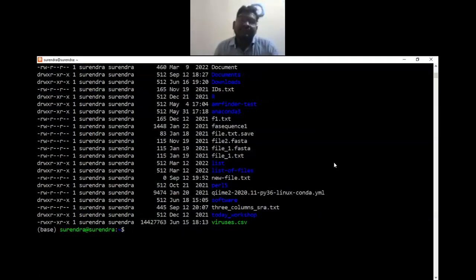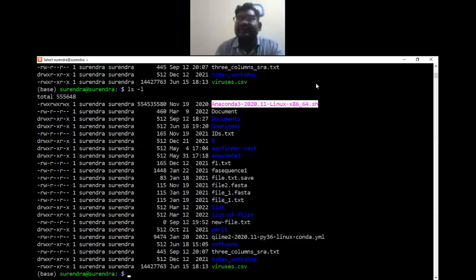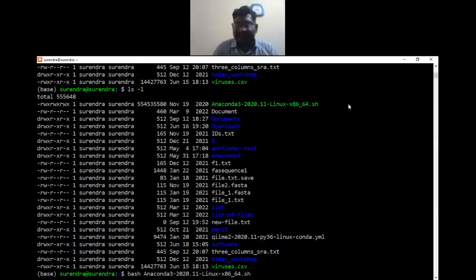Anyway, if you want to install Anaconda, you can just run it and install it here. It will be installed in your home directory as I am using here. It is here, Anaconda 3. So it is installed inside the home directory. And you should go to the location where your installer is downloaded. If you are not at that location, you can't run this command, like bash and then the sh file, to execute it for the installation.